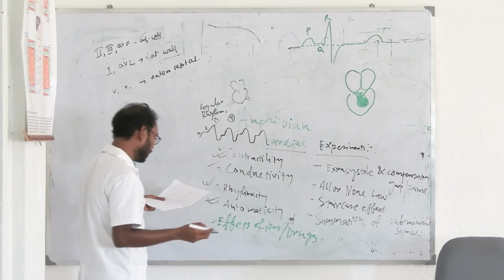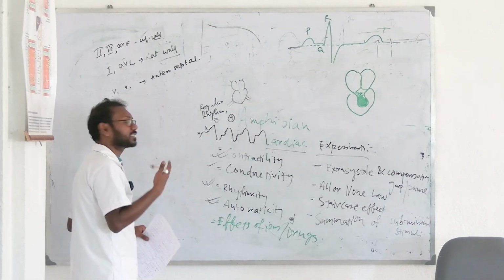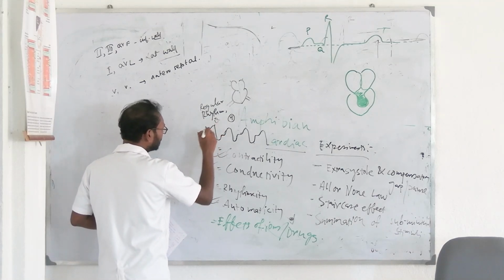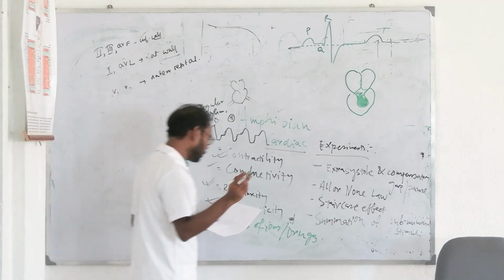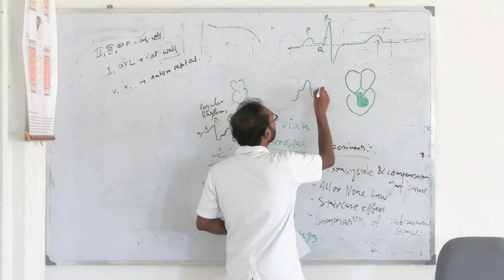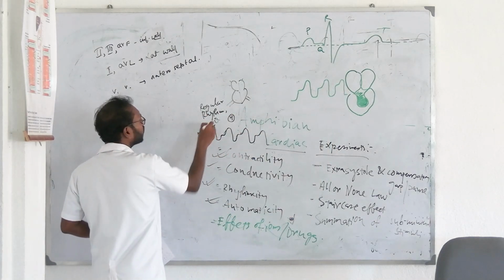Next, moving forward, this is the extra systole and compensatory gap or compensatory pause. So what is extra systole? Why were we talking about extra systole? Now if you see this graph, the normal amphibian heart is like this. This is actually your systole, okay?